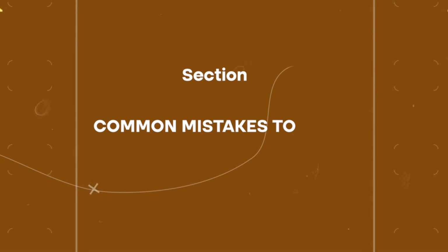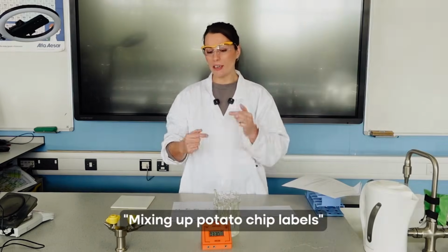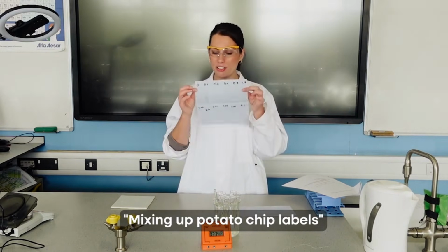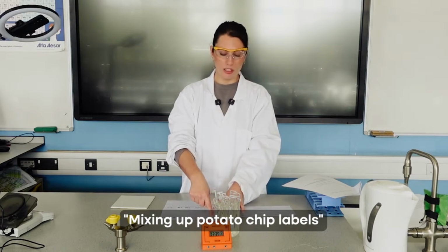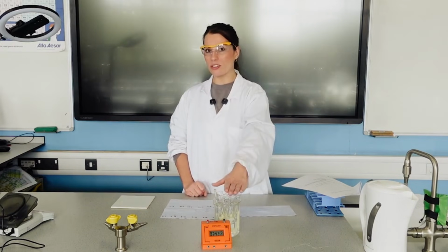So in summary, some of the common mistakes to look out for are the labeling of the potatoes to make sure they're going into the correct boiling tube. So doing something like this, where you are literally labeling on a piece of paper which piece of potato is going into which boiling tube and what was their start mass, and make sure you're taking it out and placing it in the same place, and all of these are labeled.